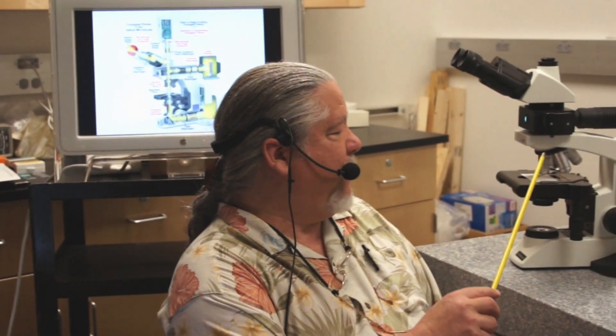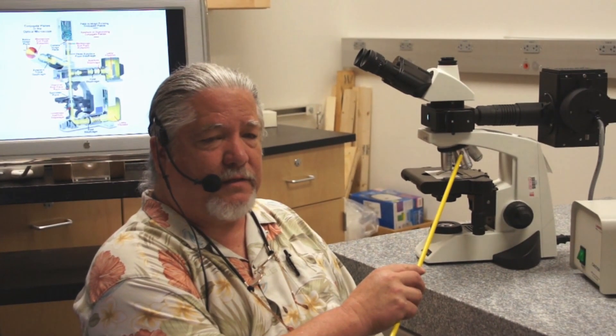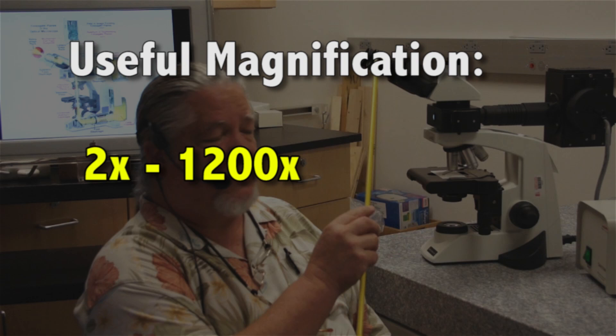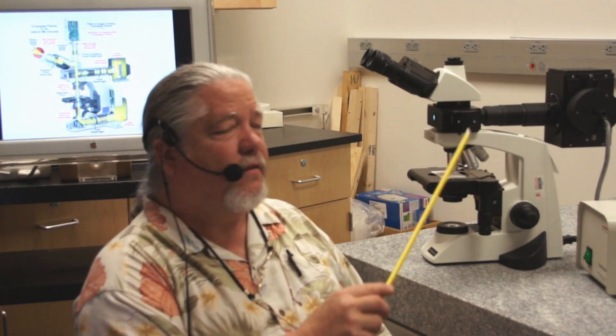This is a different instrument. This is called a compound microscope. The reason this is called a compound microscope is because to get the resultant magnification out of the instrument, you multiply the magnification of the objective lens times the magnification of the eyepiece lens. Ergo, this is a compound microscope.